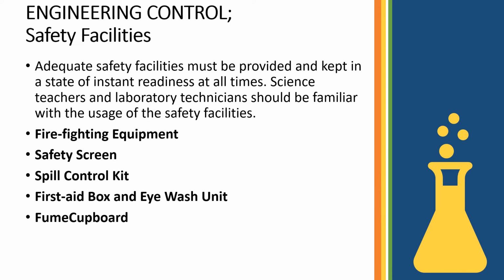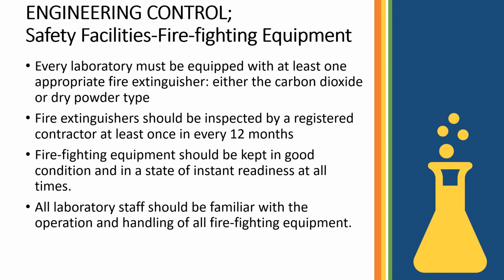Adequate safety facilities must be provided and kept in a state of instant readiness at all times. Science teachers and laboratory technicians should be familiar with the usage of the safety facilities: firefighting equipment, safety screens, spill control kit, first aid box and eye wash unit, fume cupboard, and engineering control.